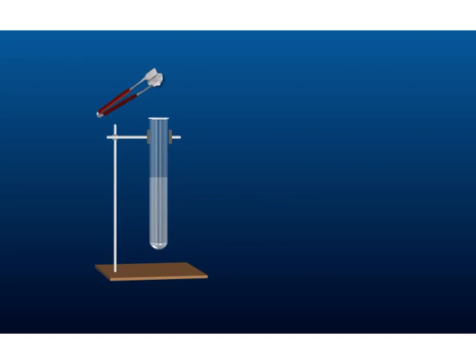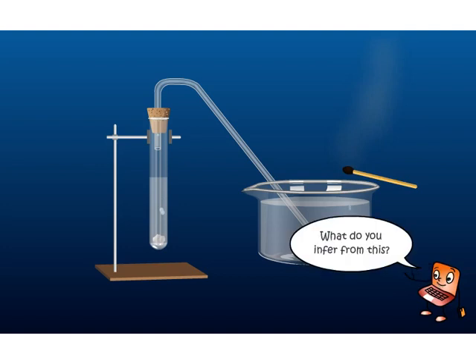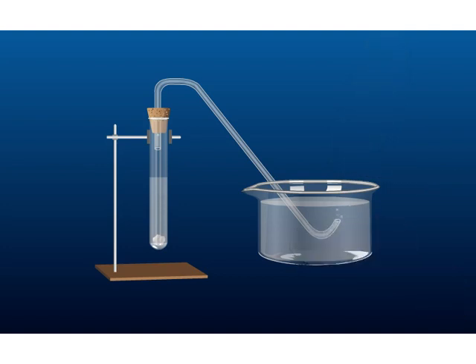Add a few pieces of zinc granules to it. Pass the gas that is evolved through the soap solution. Take a matchstick near a gas-filled bubble. What do you infer from this? Bubbles are formed due to the liberation of hydrogen gas. This is shown by the fact that the gas burns with a pop sound.